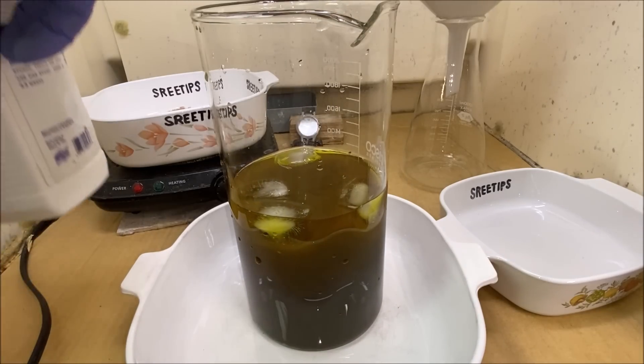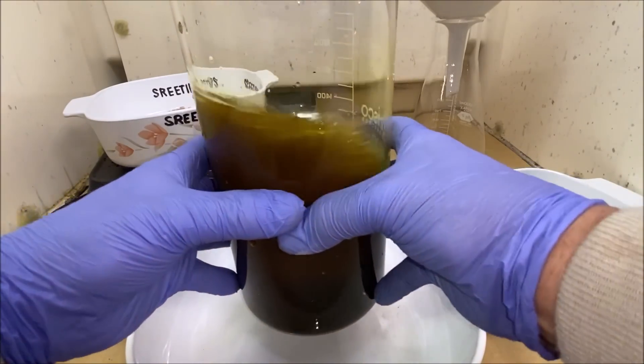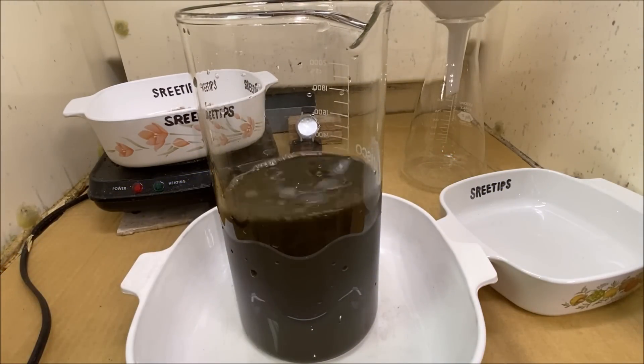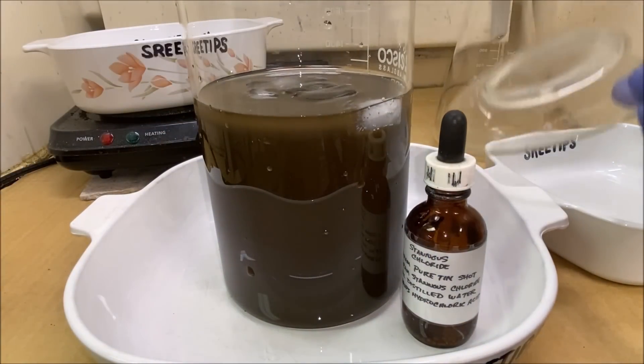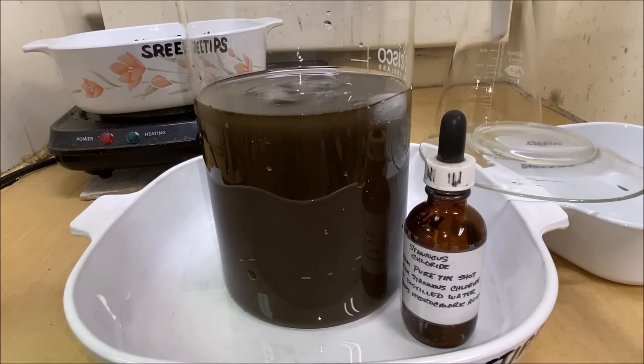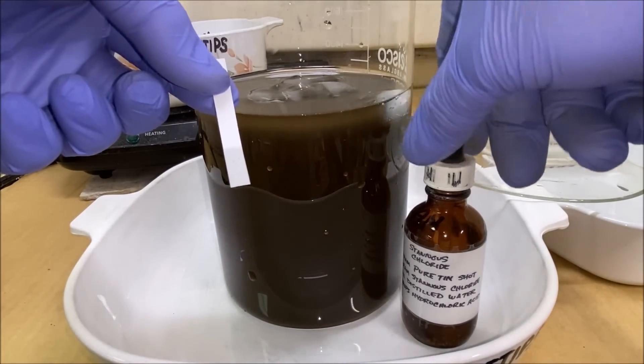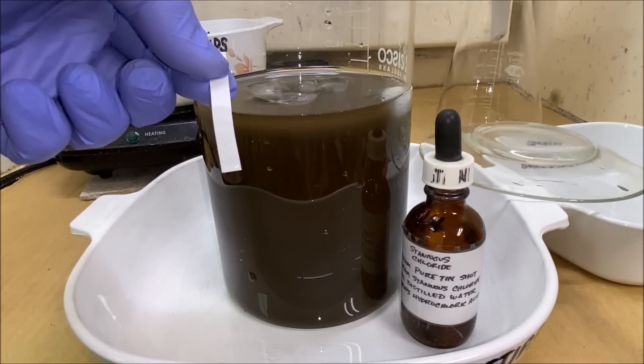That should just about do it for us, give us a stir. Let me reach in here to get a little of our solution on a piece of filter paper. We're going to test this with stannis chloride just to make sure we've got all the gold dropped out of that solution. And there you can see that negative stannis test means all the gold has been precipitated.